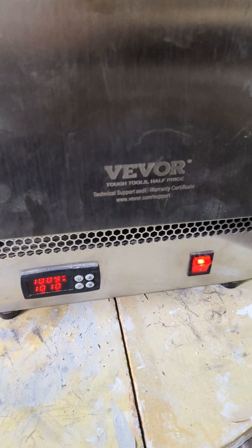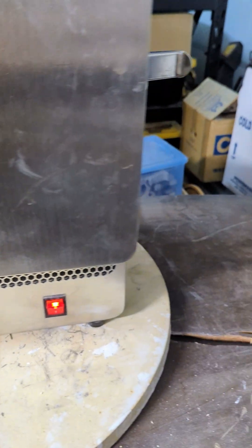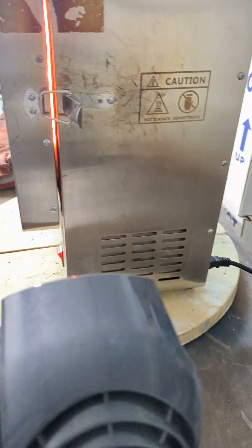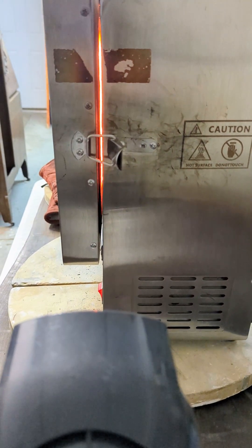I do believe the cupellation process is complete. I'm going to let it sit there just a few more minutes just in case, with the fan going and the door still propped open, to make sure.